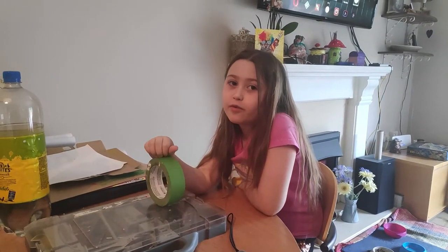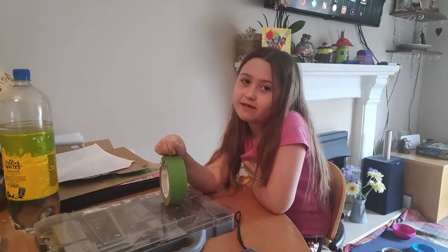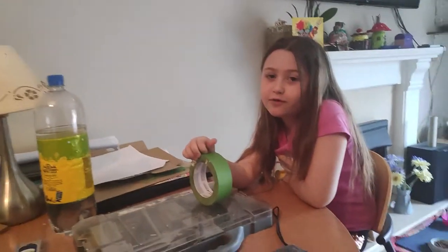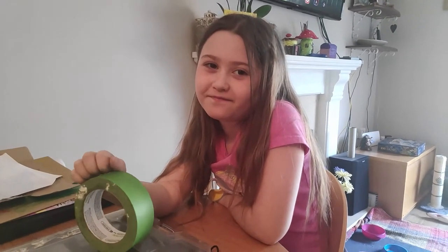Caitlin, what are we going to make today? We're going to make a microscope. And how are we going to make it? We're going to make it out of some old lenses from an old broken camera and a laser pointer that we've got.